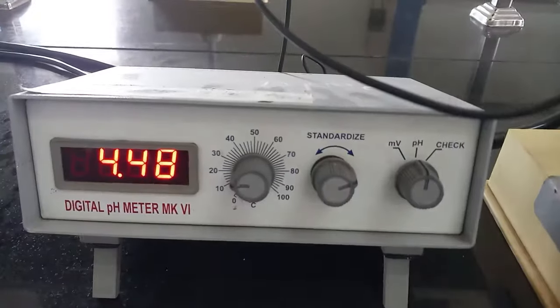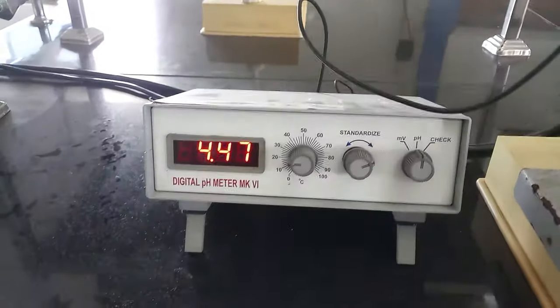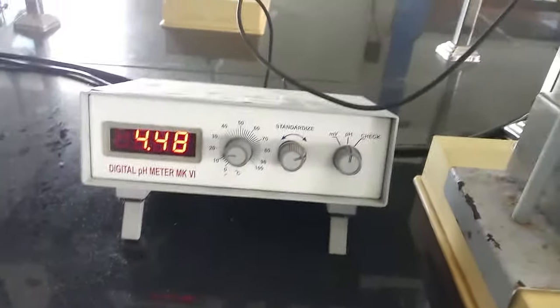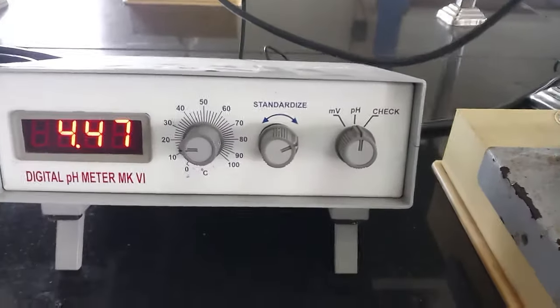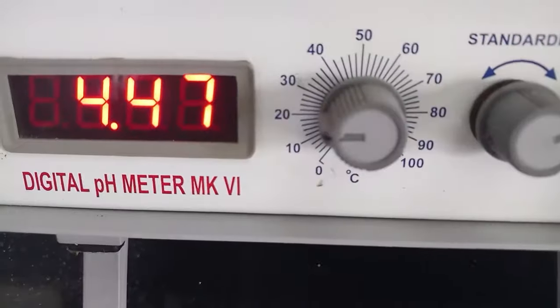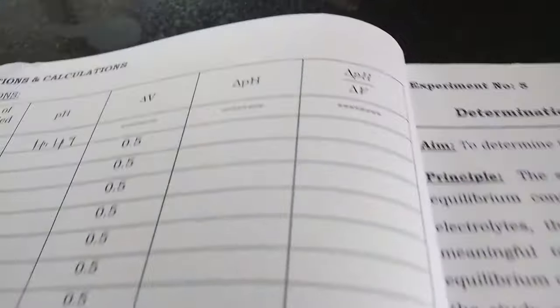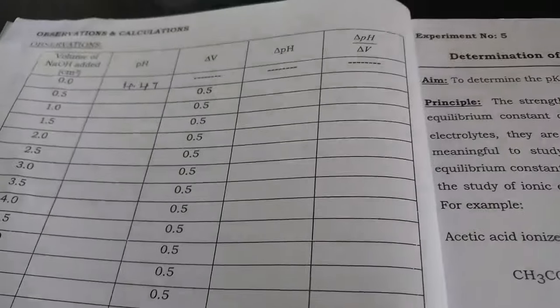Now this is the digital pH meter. It gives the pH value, the potential of hydrogen ion concentration. First we have to record the initial pH in this observation part.